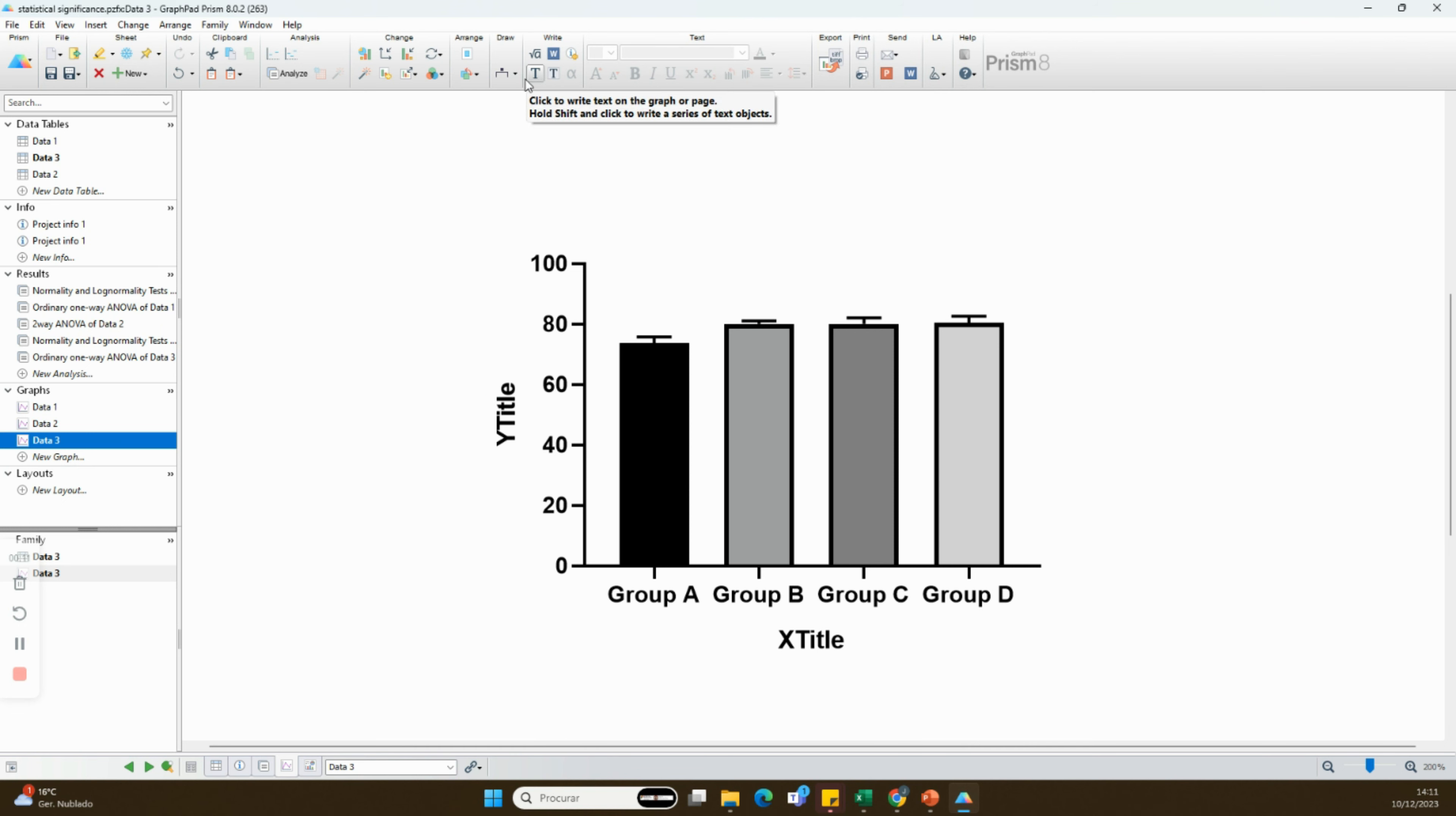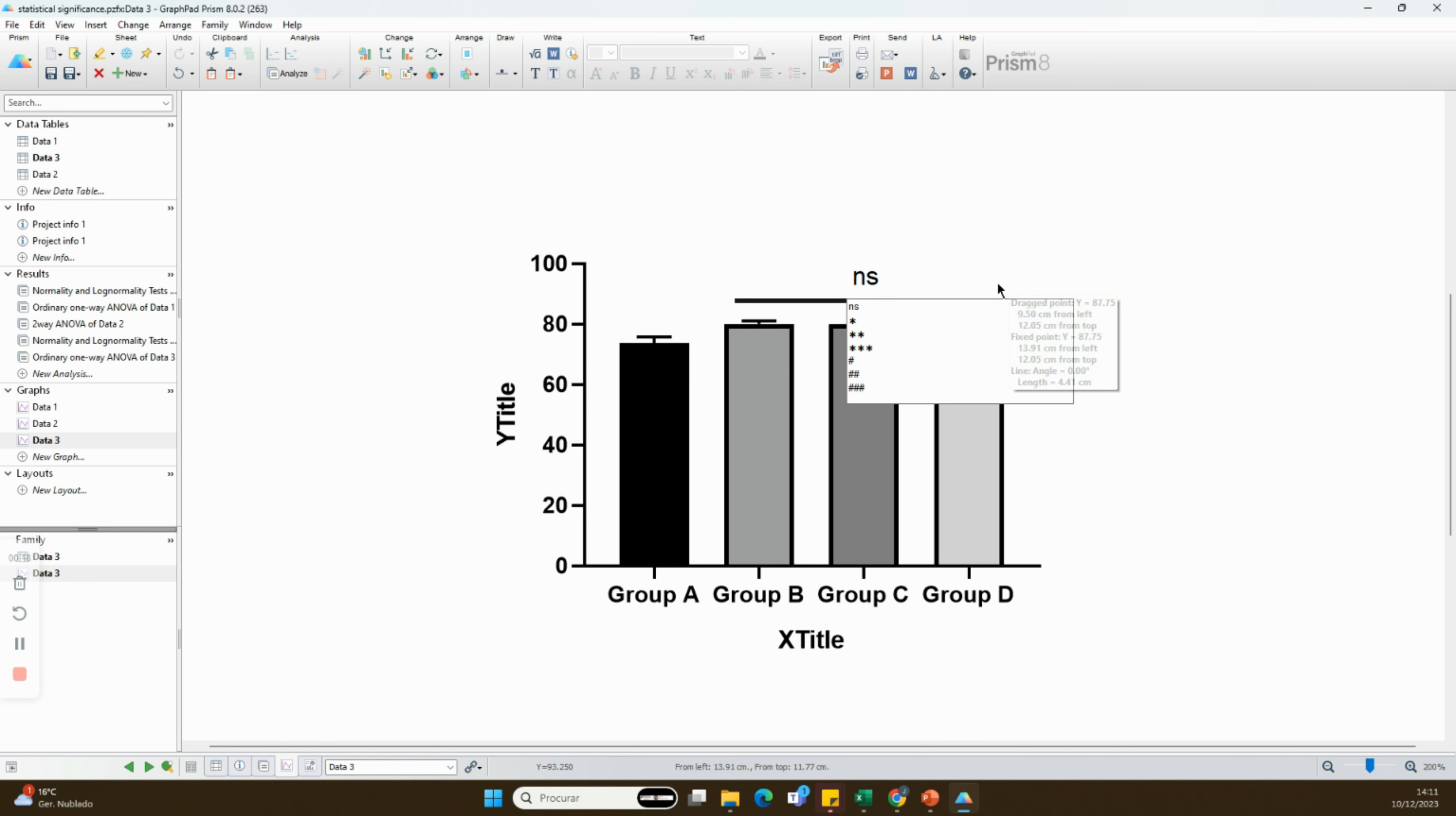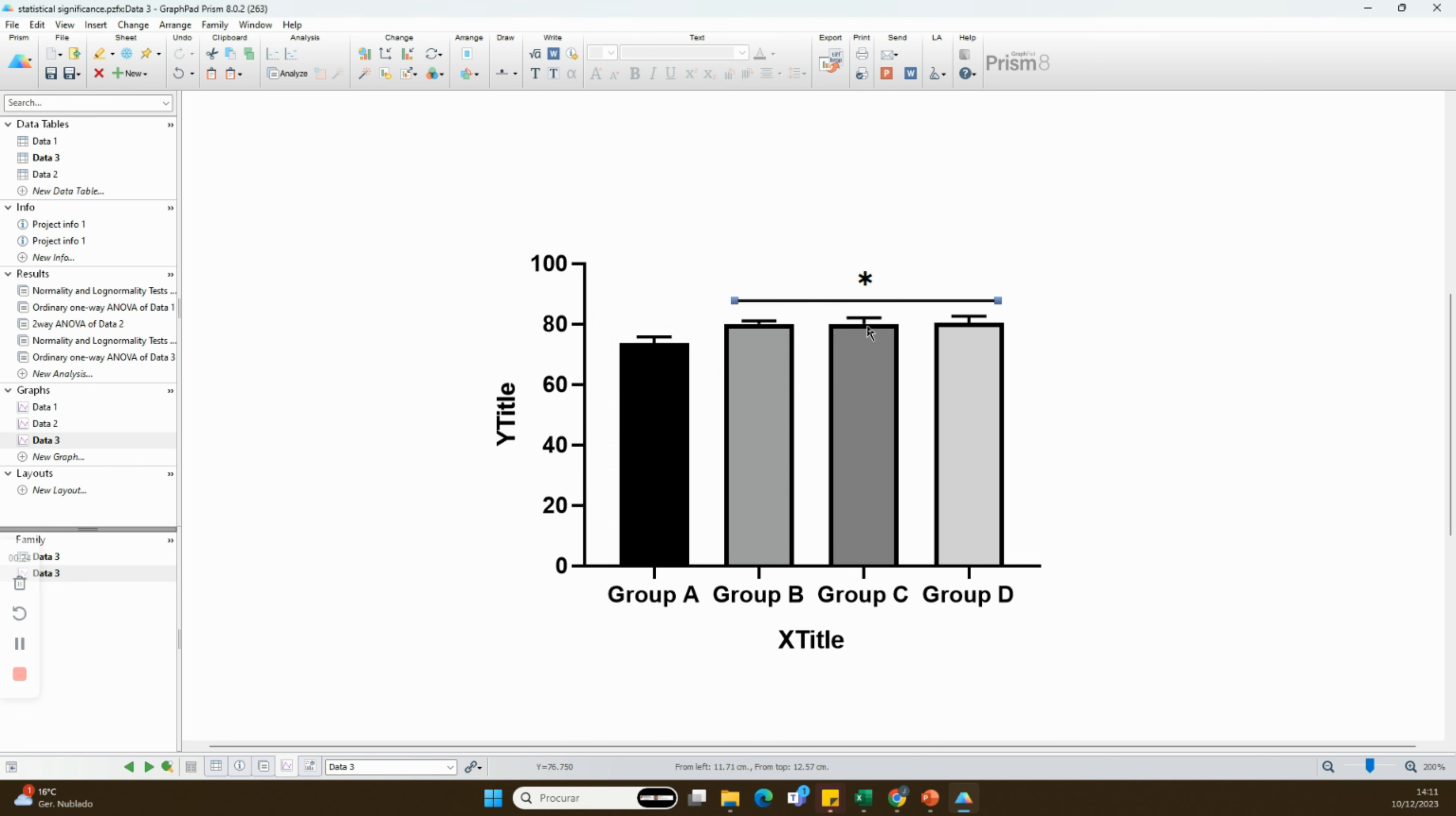Alternatively, when you have the same degree of significance between one group and the other groups, you can simply denote it with a line above the groups with the corresponding statistical symbol.